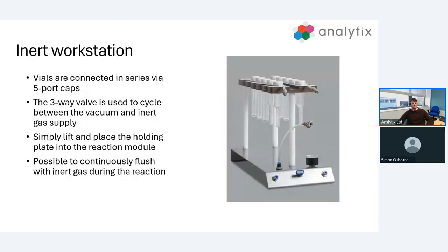Secondly, we have our inert workstation. When you're wanting to work under an atmosphere and you don't want to individually inertize your vials, we can inert all of them at once using our five port caps connected in series. Here we're using a three-way valve with a vacuum and inert gas supply. We can use any inert gas but typically we use nitrogen. By cycling between vacuum to inert, we're firstly evacuating all the atmospheric air from the vials and then replacing it with inert gas. We cycle between these two for a few minutes a couple of times.